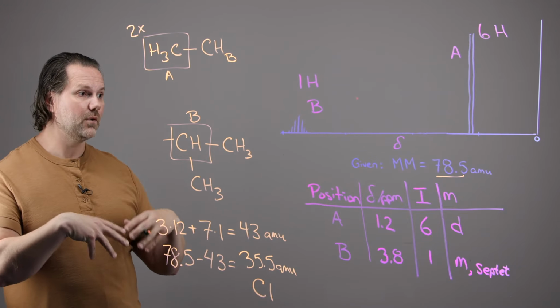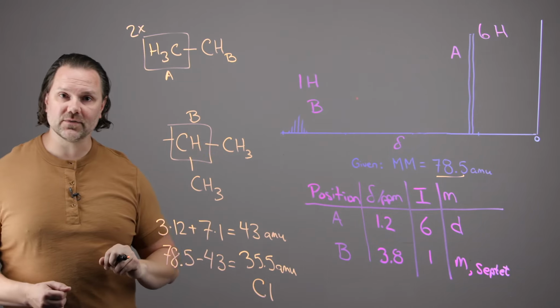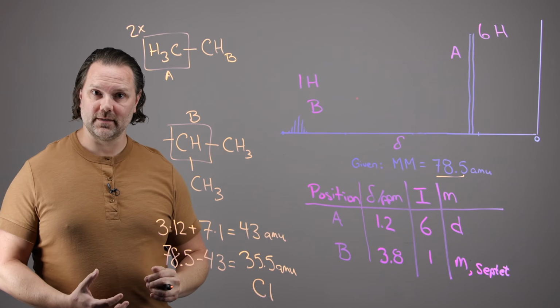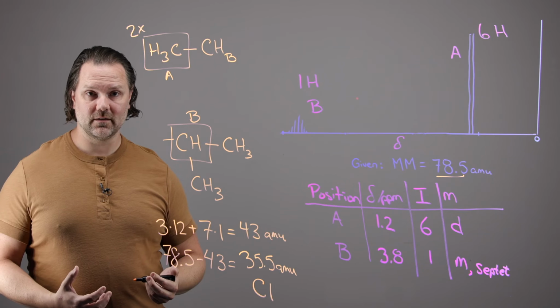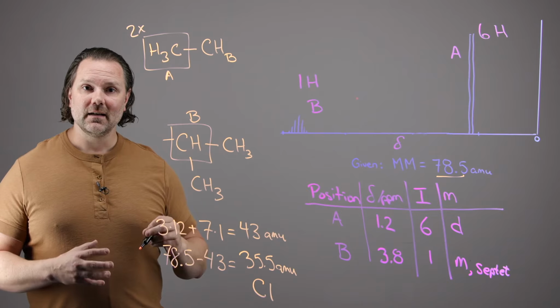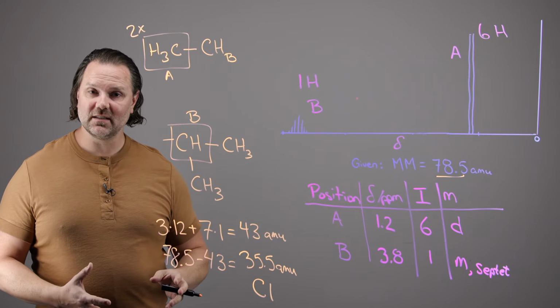So, before we go further, we've not yet thought about our chemical shift and whether or not we can explain why it's occurring. A CH3 group would normally show up where in our chemical shift along that axis? Pause the video, get out your spectroscopy data sheet, and check.